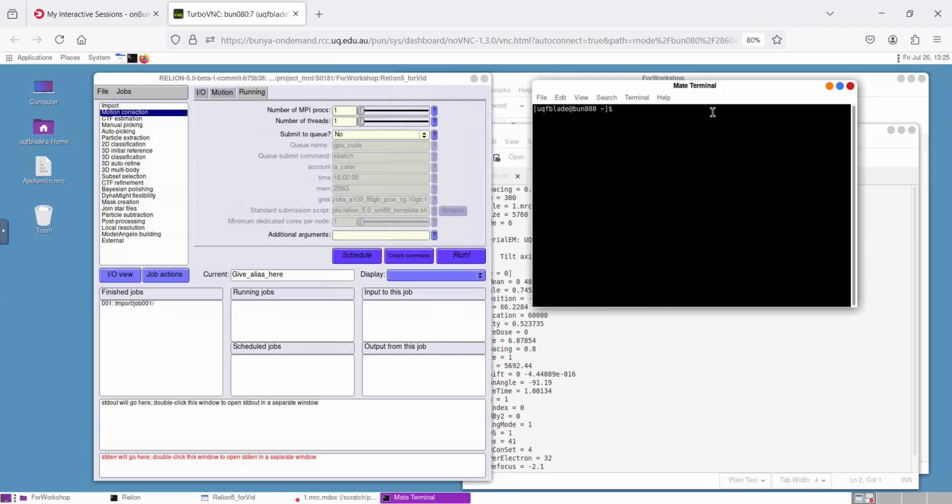by popping open a terminal. I want to run the command nvidia-smi, and that is going to tell you exactly how the GPU beneath this desktop is running. But to have that constantly update, we need to add watch. So watch nvidia-smi.